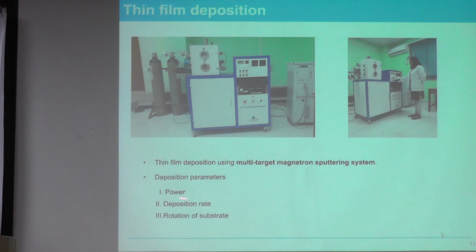So how can you identify the deposition rate? You can deposit this phase change material, and some advanced setups have an instrument directly inside, and they can calibrate it directly. But otherwise you can also get some understanding of the thickness, or you can do reflectivity measurement, or some AFM, cross-section FESEM, and then you can see how much thickness you are getting with respect to your sample, and then you can calibrate.